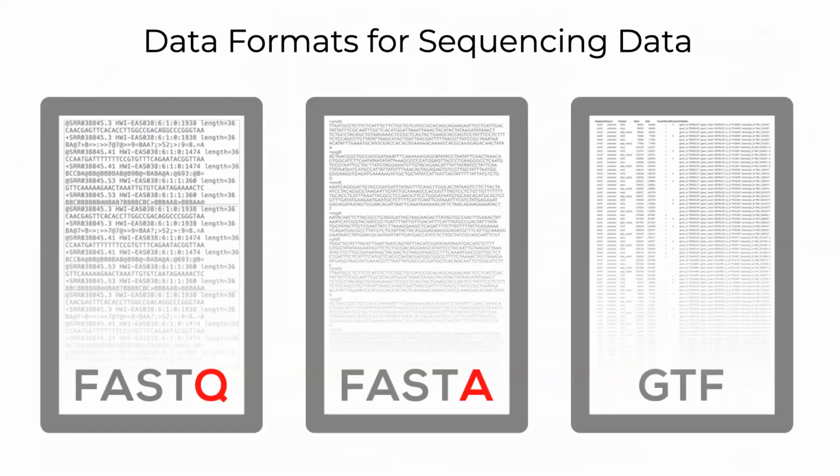FASTQ files, which contain individual reads. And so you have to understand what a FASTQ file looks like to really know what the process of analysis is required to extract meaningful information out of this kind of collection of short reads.